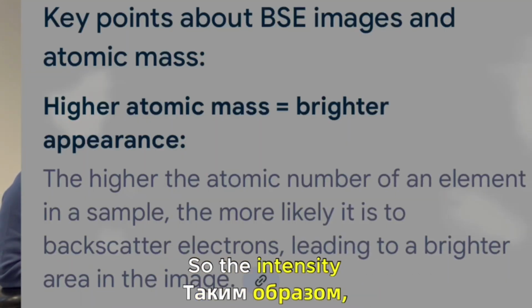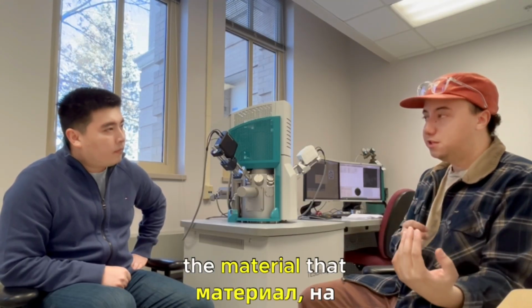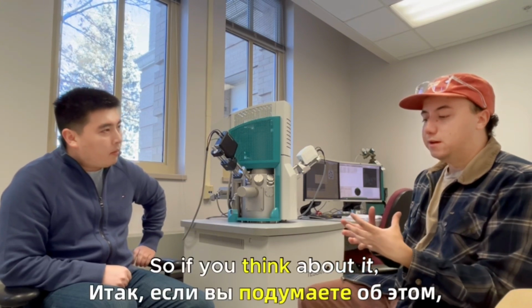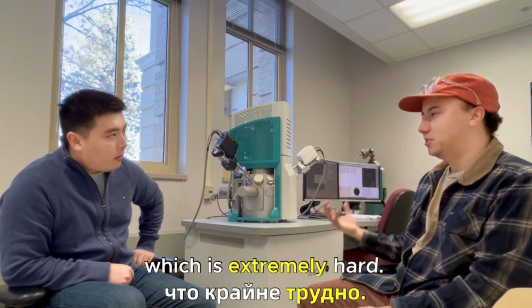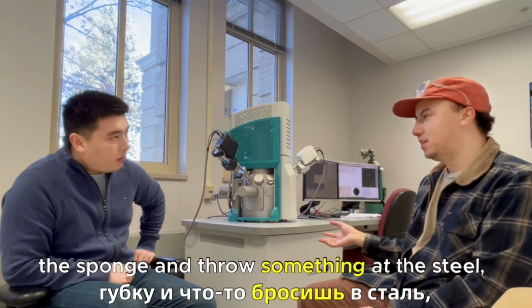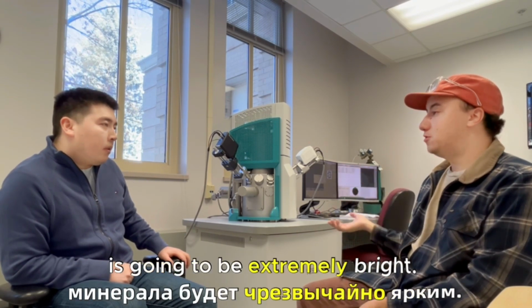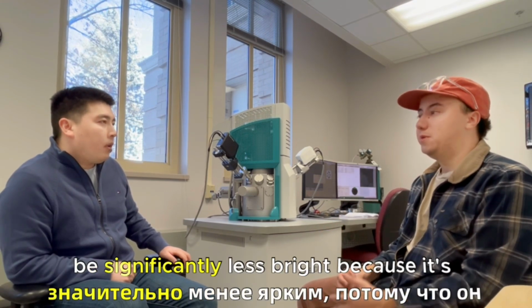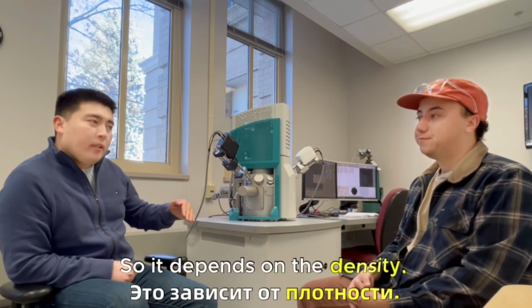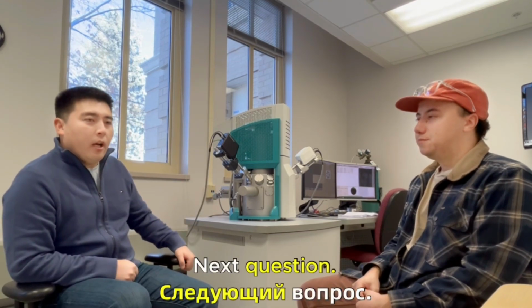The intensity of the backscatter is a direct function of the mean atomic number of the material that you're looking at. Think of a sponge, which is very soft, versus steel, which is extremely hard. If you were to throw something at the sponge and at the steel, you're going to get a different level of rebound. It's less about the hardness and more about the density, I suppose. So something like a lead mineral is going to be extremely bright. Gold is going to be extremely bright, whereas quartz is going to be significantly less bright because it's composed of light elements. Okay, so it depends on the density. So denser elements, higher mean atomic numbers. Okay, good.